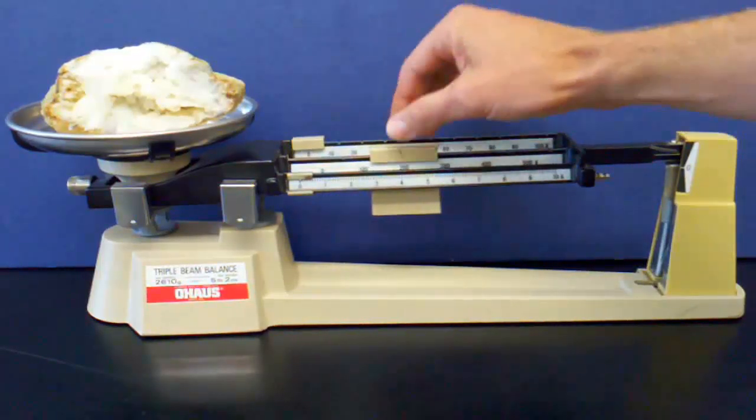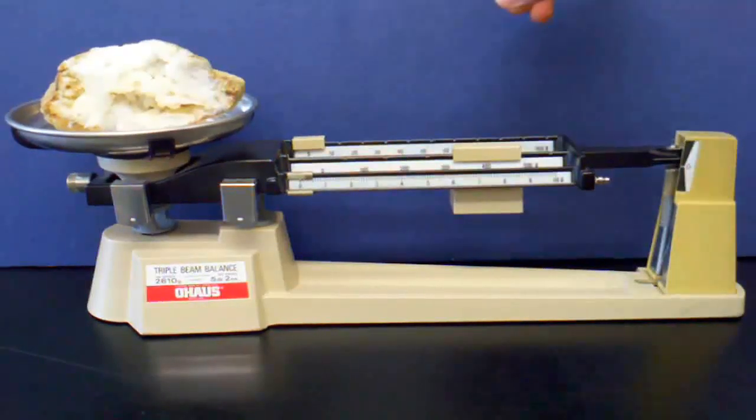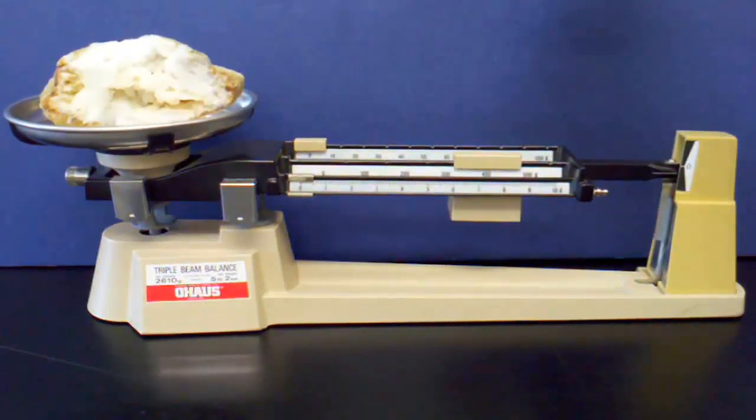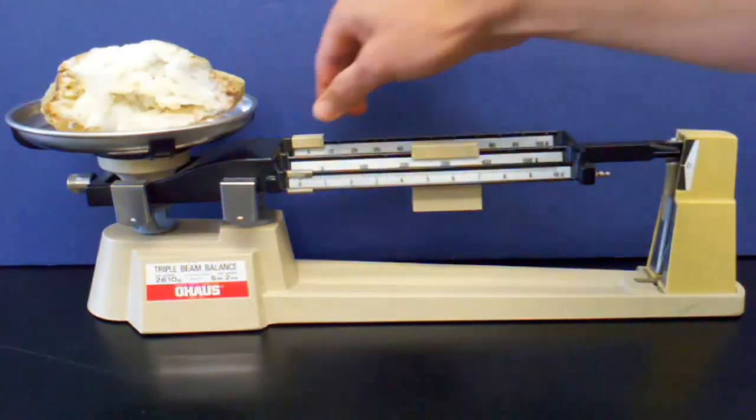Starting with the 100-gram slide, I slide it along the rails until I find it is heavier than the object in the pan. Then I back it up one notch.